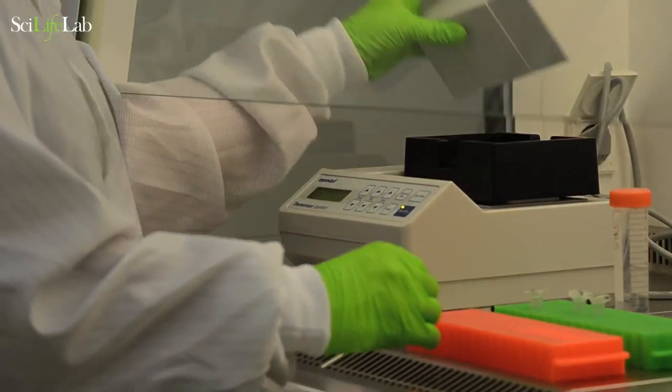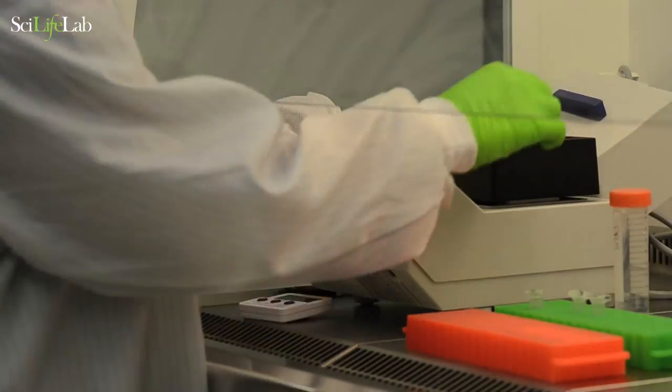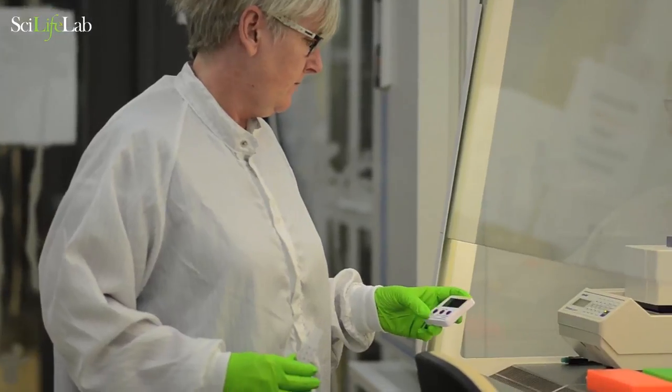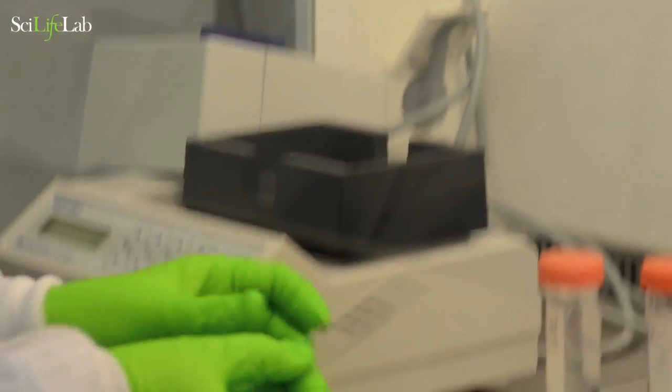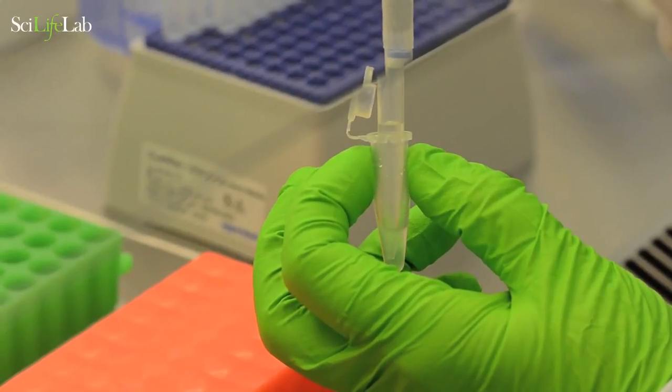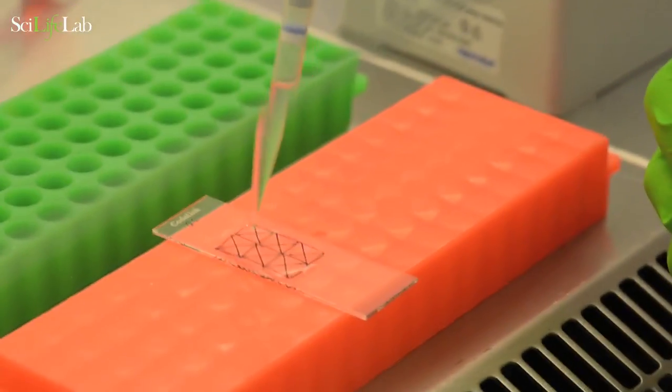Start the ST protocol by putting the glass slide into an incubator at 37 degrees for one minute. Place the glass slide in a horizontal position. Add 900 microliters of 4% formaldehyde diluted in PBS.